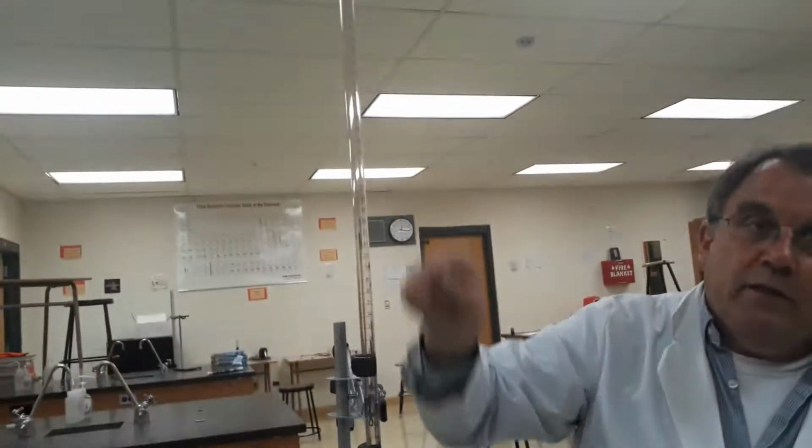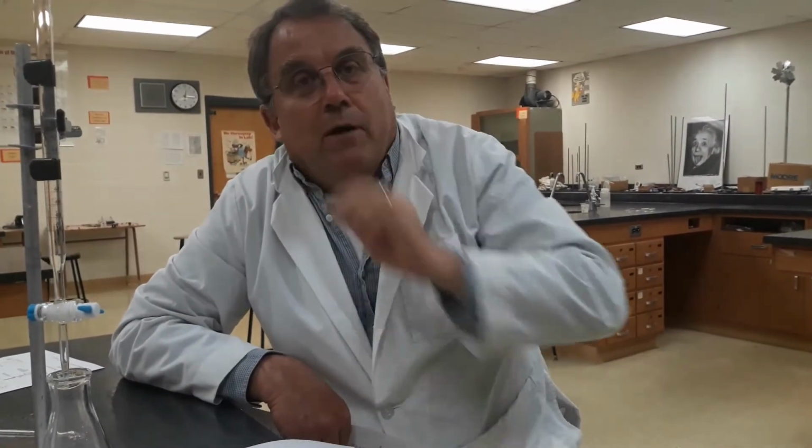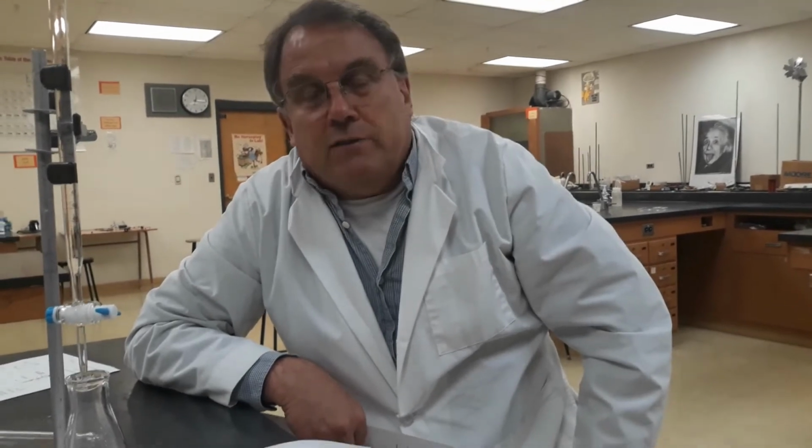Okay, the standardized base has already been conditioned in the burette and is loaded. Another difference is I'm not going to say what the readings are. I'm just going to have the cameraman pause at the initial reading and then at the final reading. And the only initial reading that is 0 is this first one. The rest are going to be some other number and you're going to have to do the subtraction.